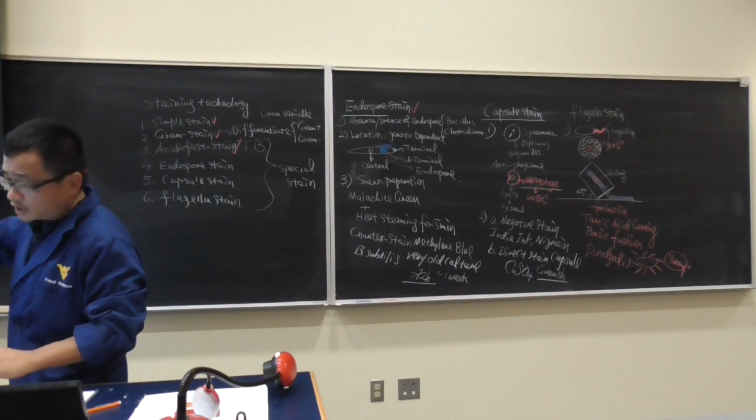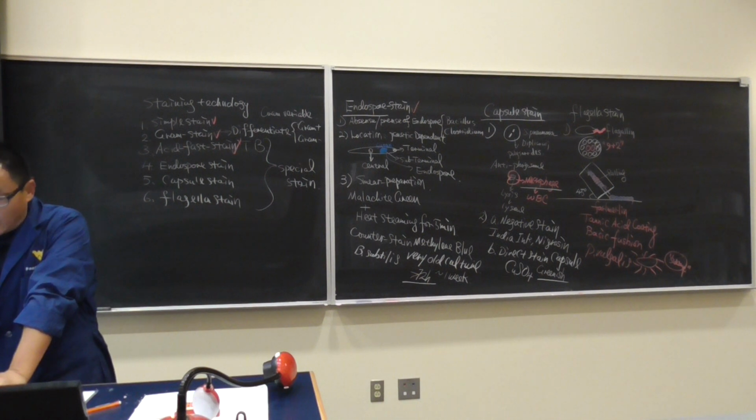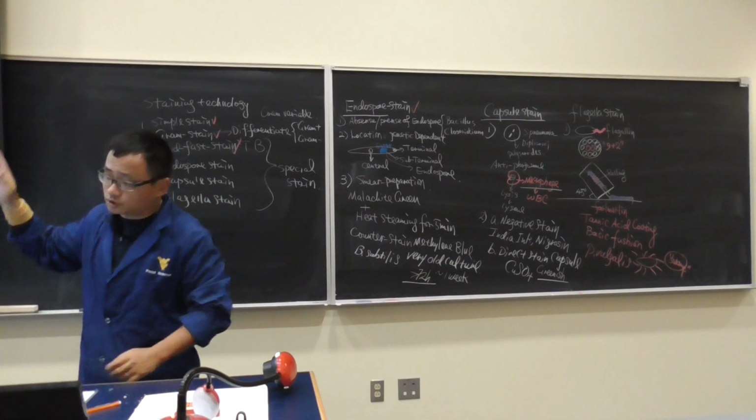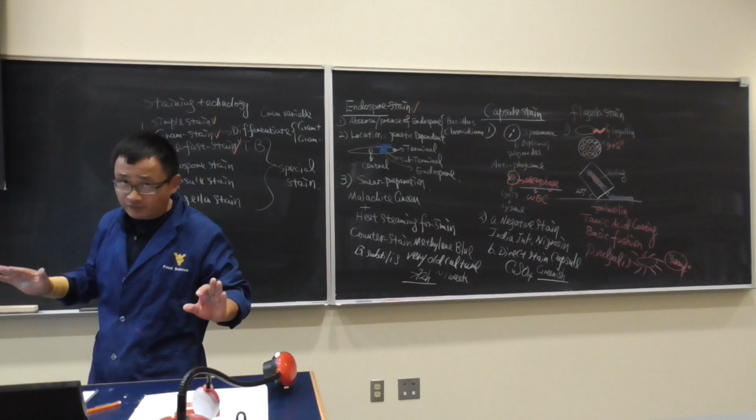Here we have a slide. I think it's a very nice slide. You can see the gram stain. And in the gram stain here, you see the first one is very similar to Staphylococcus aureus.